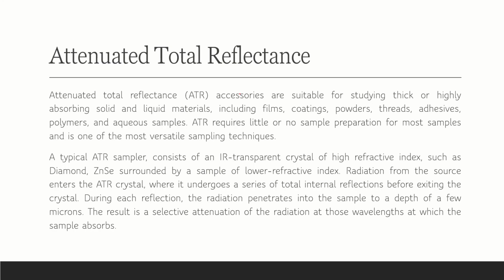Now, accessory techniques to analyze highly absorbing samples. The attenuated total reflectance, or ATR technique, is used for thick or highly absorbing solid or liquid materials, for example powders, threads, adhesives, polymers, etc. ATR requires no sample preparation. In ATR, we use a transparent crystal of high refractive index such as diamond.